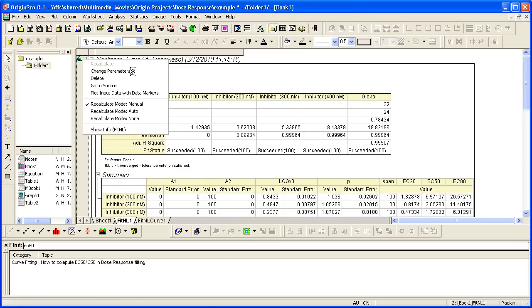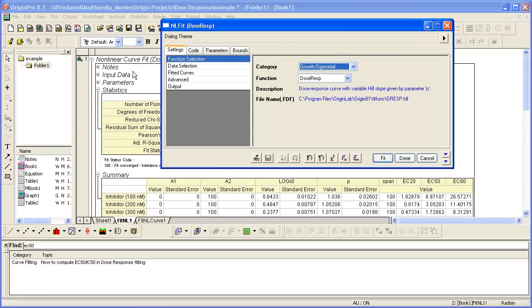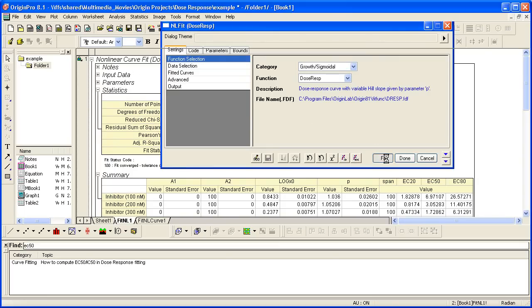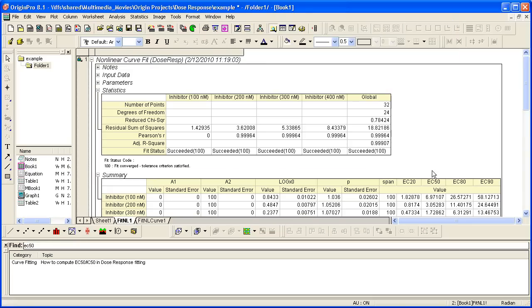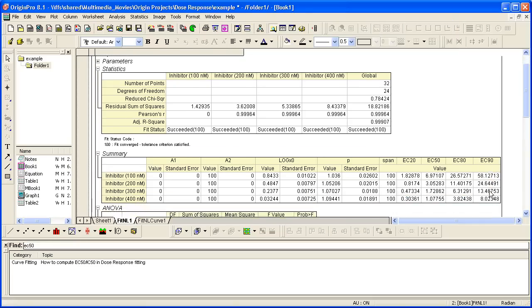The dialog reopens, and the only thing I need to do at this point is just hit Fit, which will update my results and show me that EC90 value in the summary table.